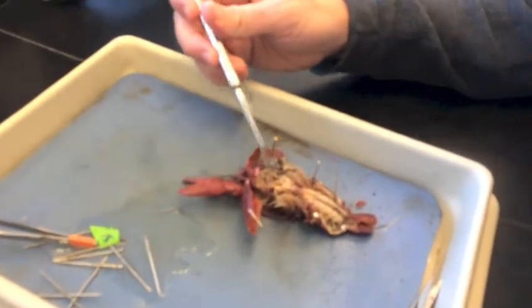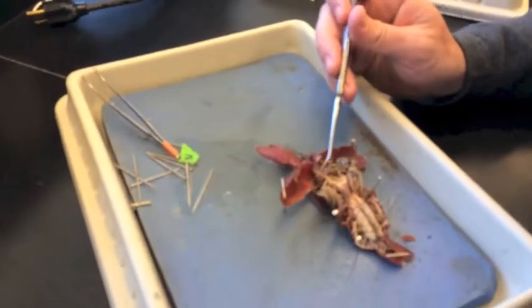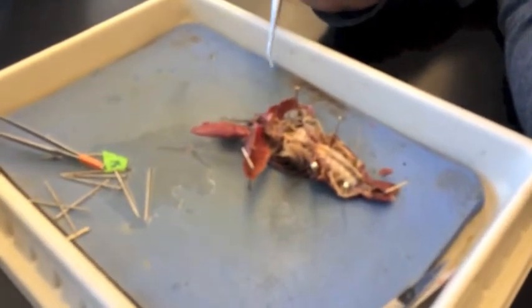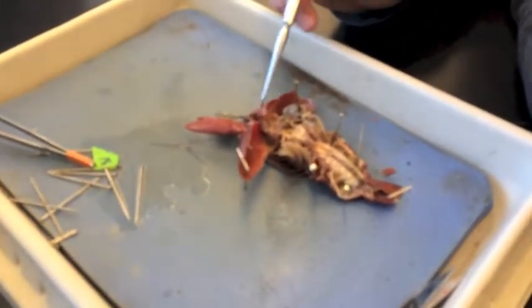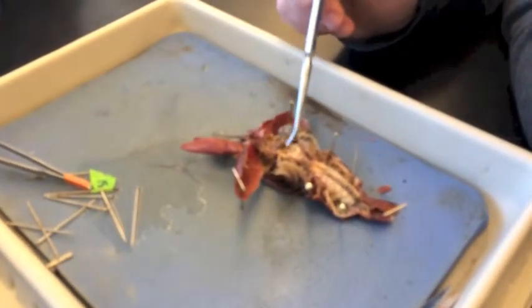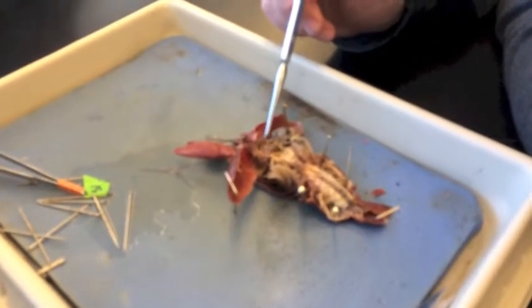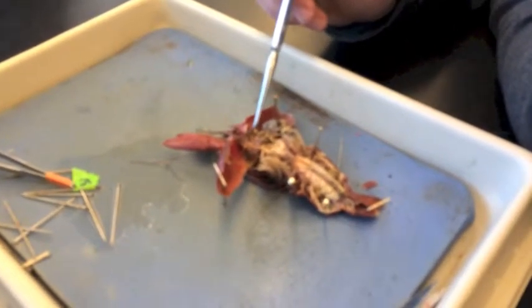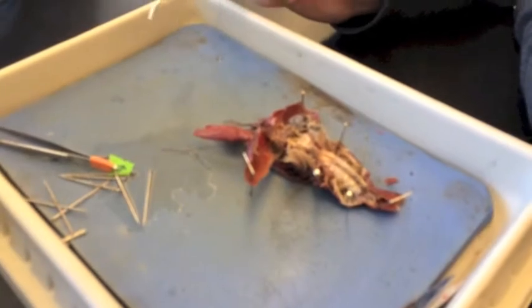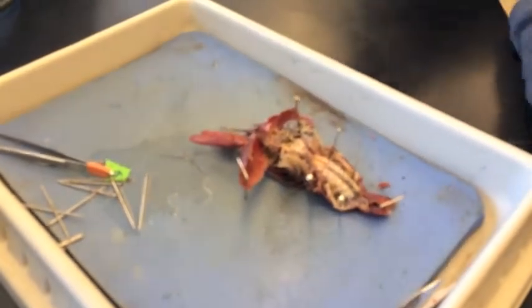And you have two discs here called green glands. They're excretory. They pee out of their face. Their nerve cords were cut. I was showing on other specimens. Normally there's nerve cords that run in here and they collect right at the base of the head, and that's called the supraesophageal ganglion, which is like a brain. And that's your crayfish.